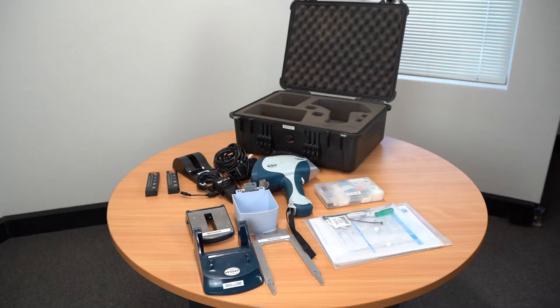Hi everyone and welcome back to Professor Spectrum. Today I'm going to show you how to pack up the XRF correctly.